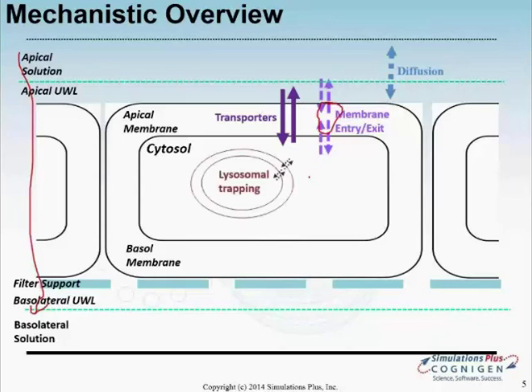For the drug that makes it inside the cell, we are accounting for possible trapping in the lysosomes. This is a topic that has been discussed a lot recently, especially with respect to drug distribution and lysosomal trapping.